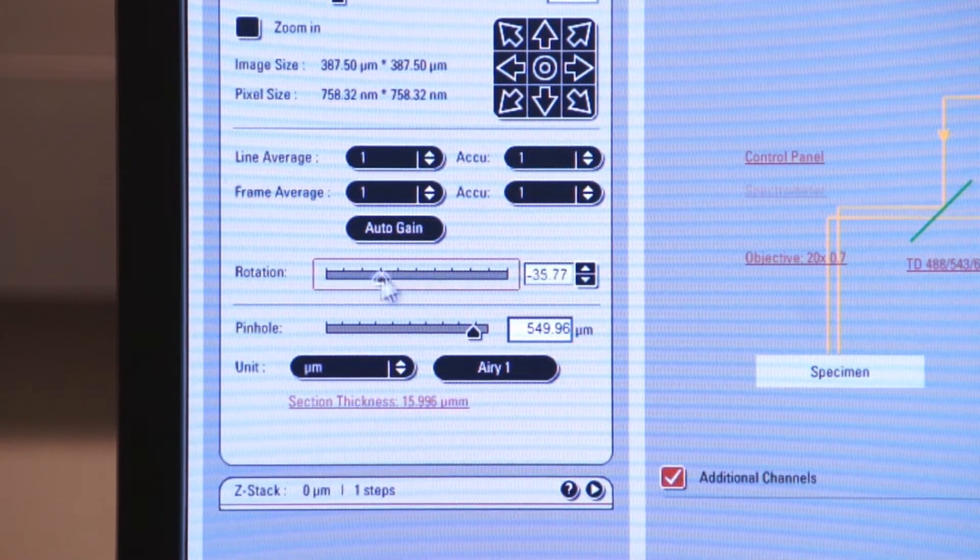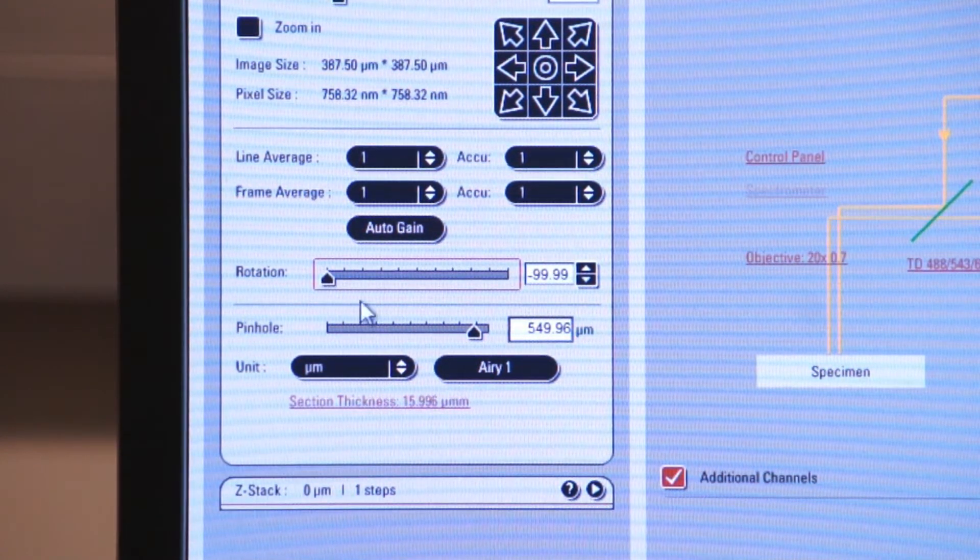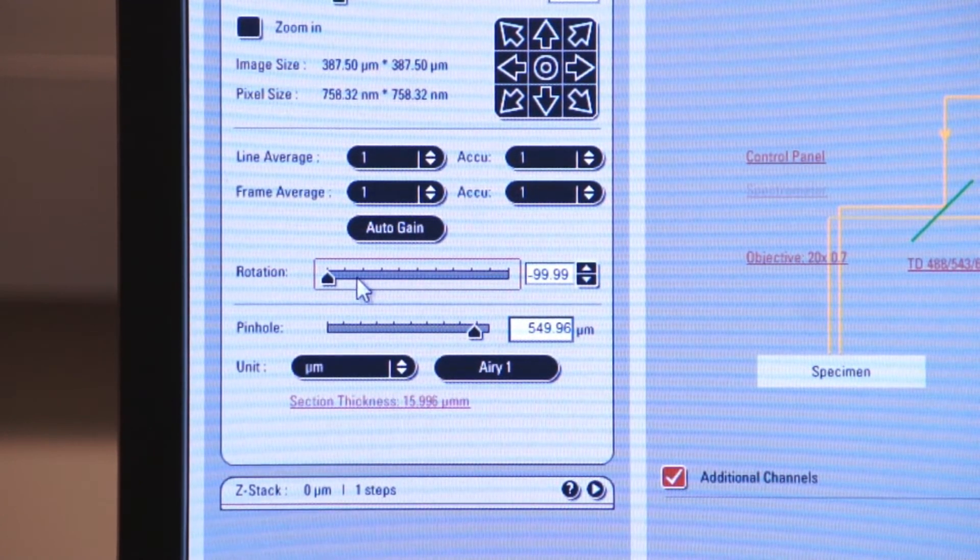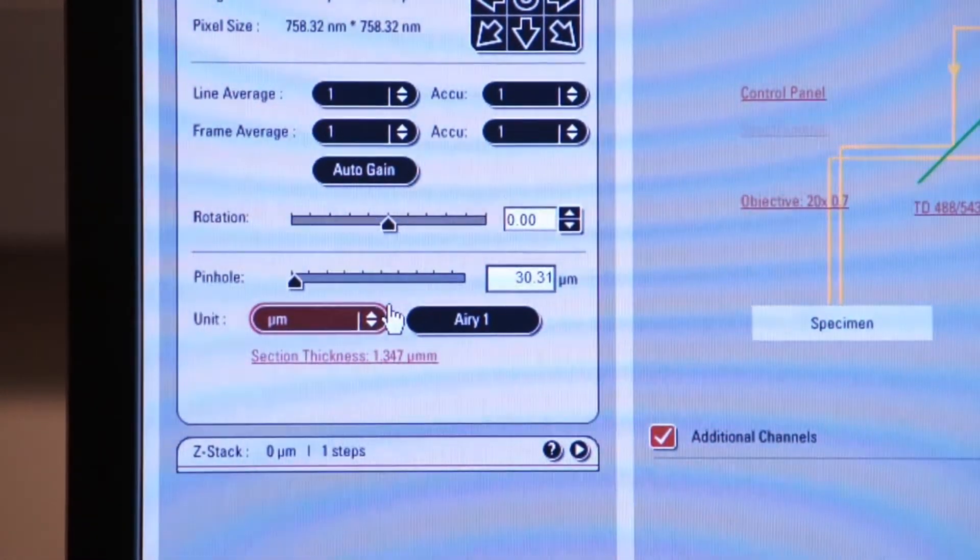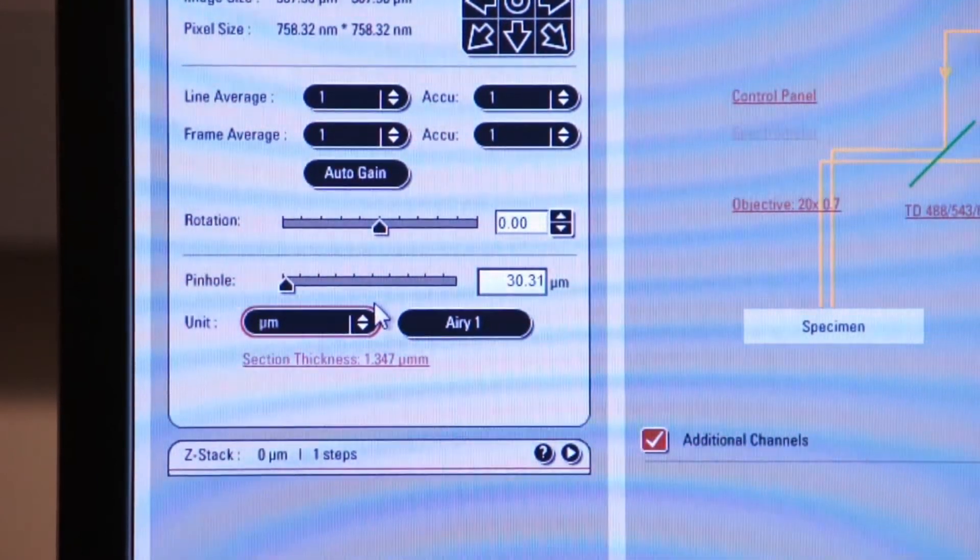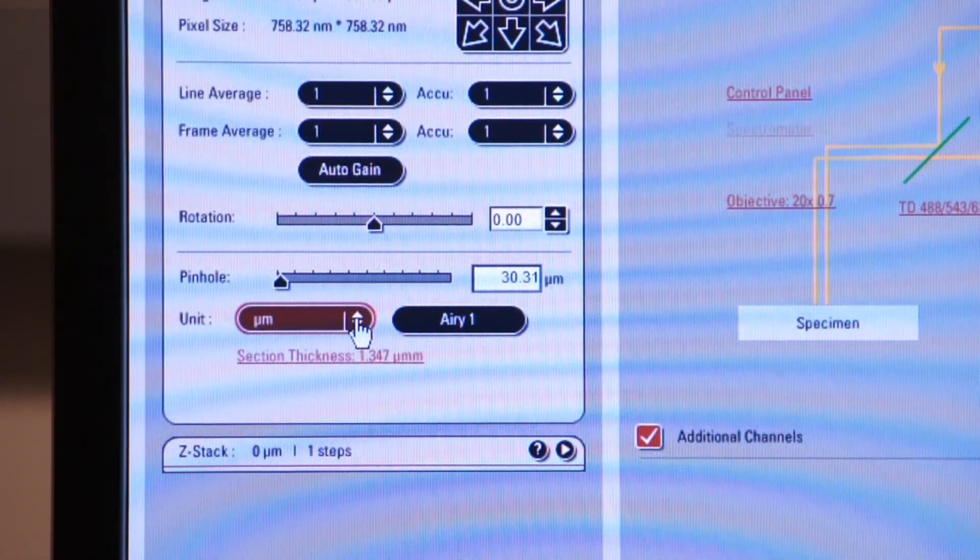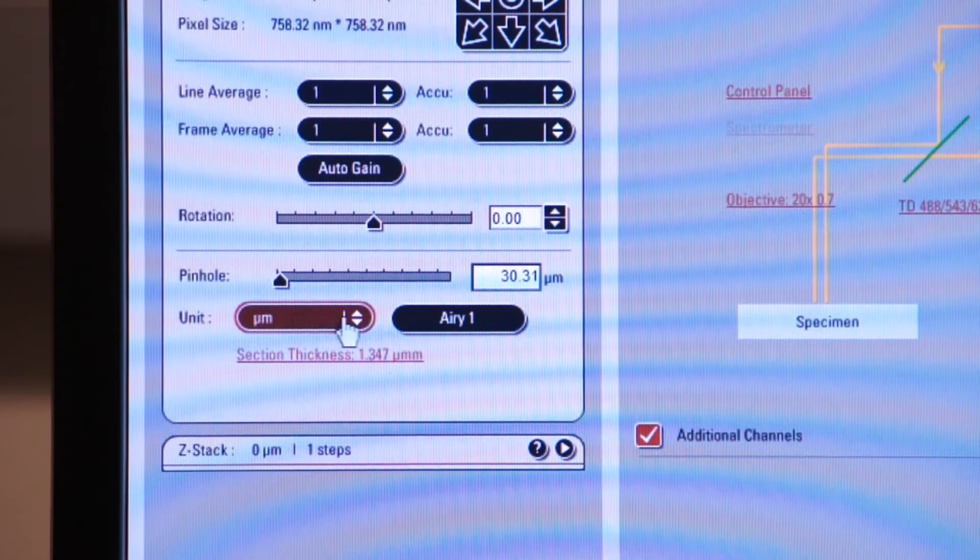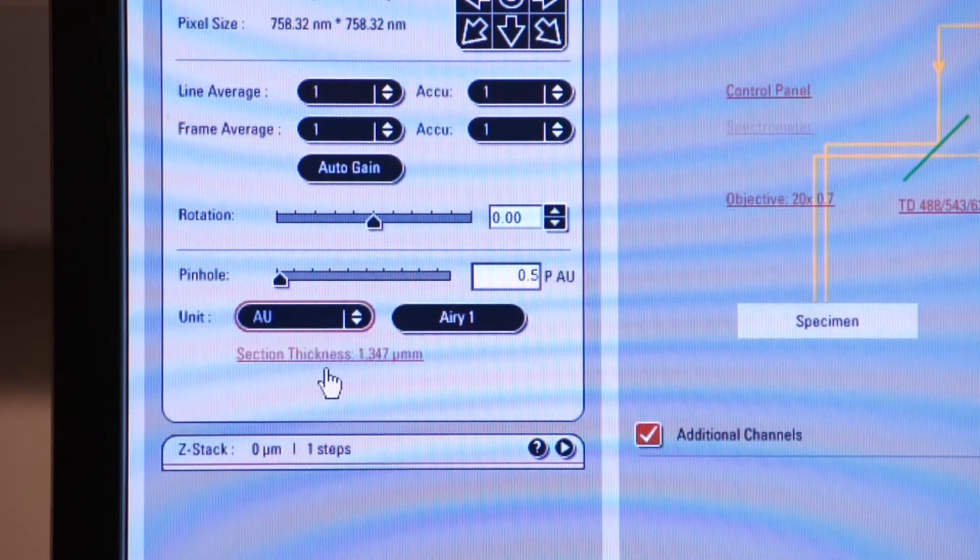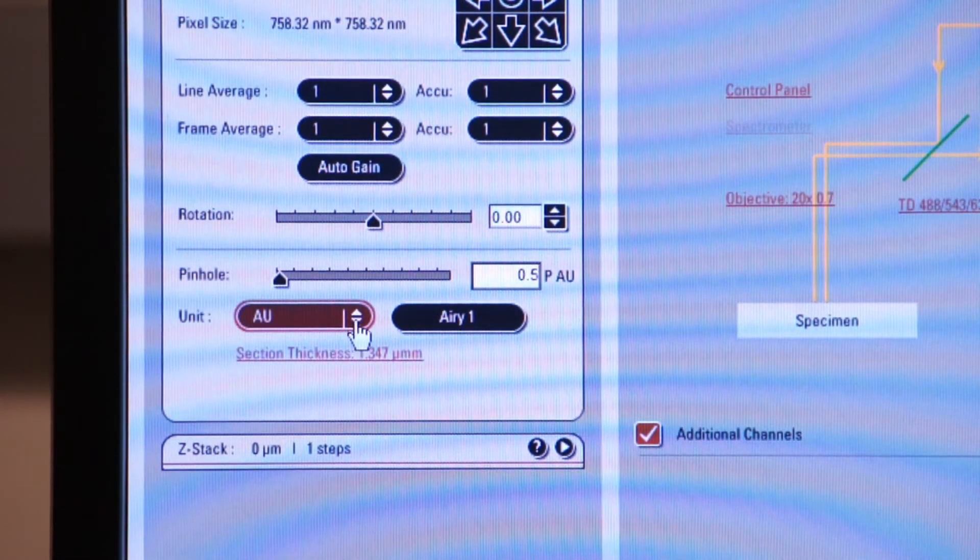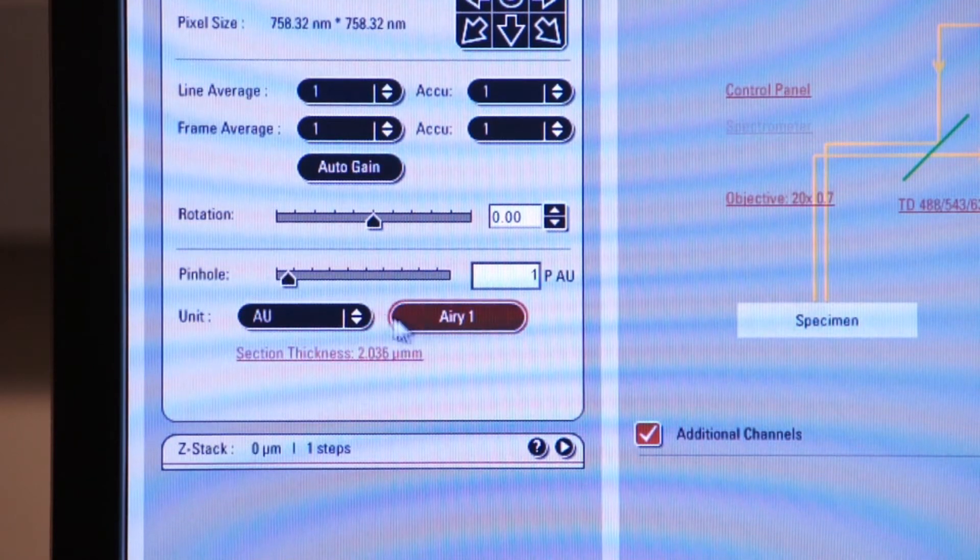So we will play with the pinhole a little bit, and I'll show you the difference in the illumination when we do that. Note also that the system gives you the ability to select the size of your pinhole in microns or in airy units. We're not going to take the time to discuss airy units right now.